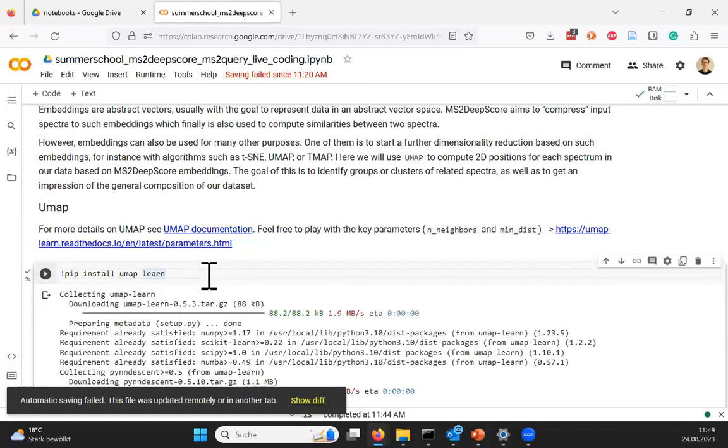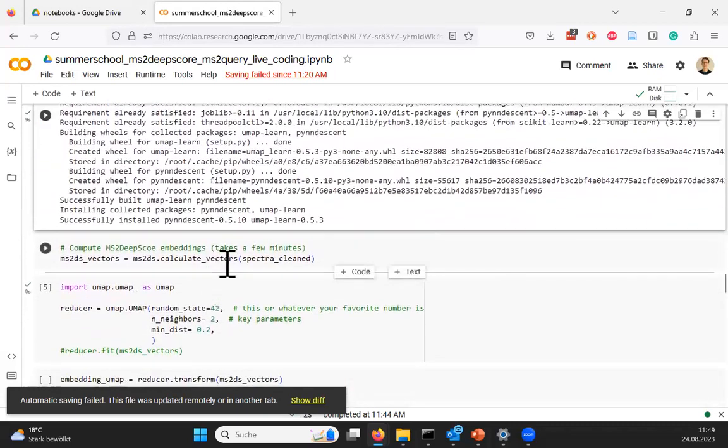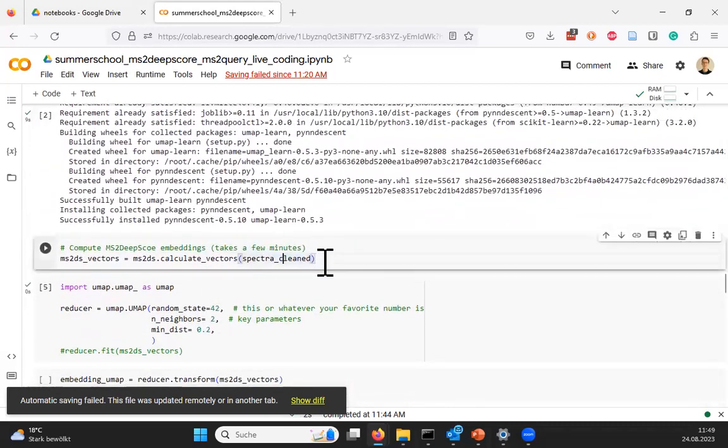And then in the last 10 years, there are at least two tools that are fairly standard now. One is t-SNE and one is UMAP. I'm not going into details about these tools here, but they typically do a better job in compressing complex data, at least visually, which is usually what people prefer. So we're going to do this with our vectors. For this, we have to install UMAP, which is luckily also provided in Python. And then the costly step is this one.